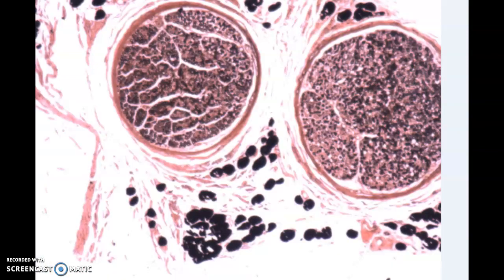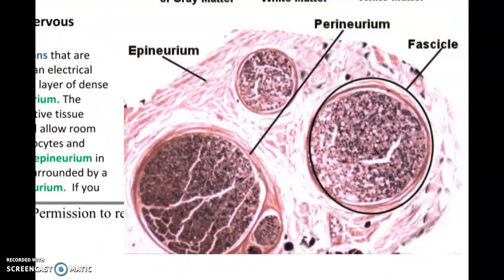A nerve is just a bunch of myelinated axons. The cross-sectional view of this: we're looking at a nerve, and it has 2 bundles in it called fascicles. And those fascicles have lots of axons in them. Oh, look, there's connective tissue surrounding it. What a surprise. Do you think it's the same order as in muscle? You betcha. So, we have the nerve here.